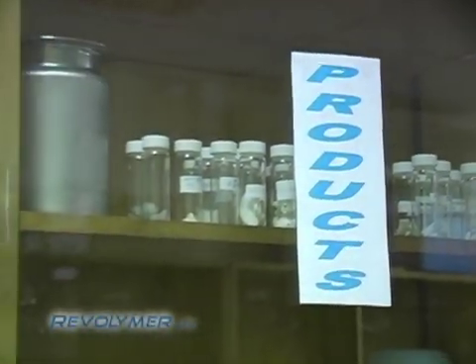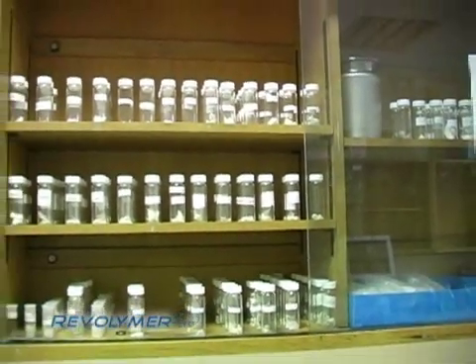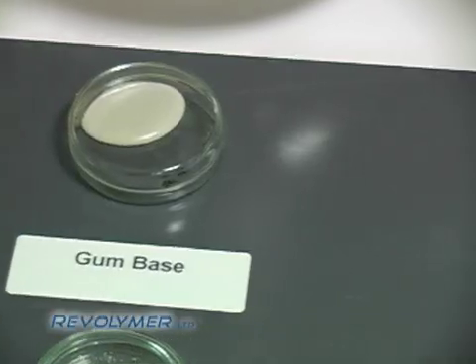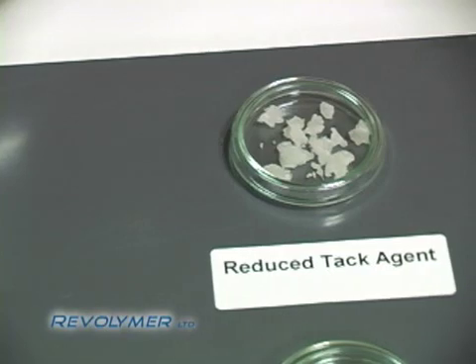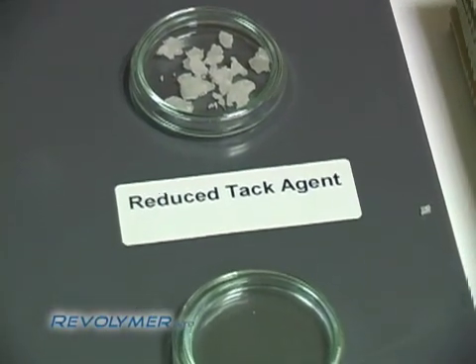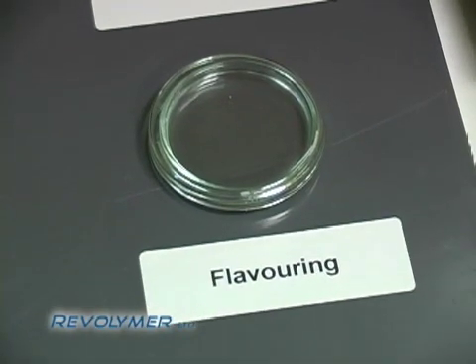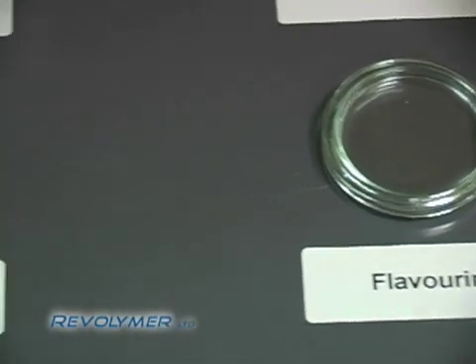In order to develop a low adhesion chewing gum, it is essential to make a very large number of different samples so that we can refine both the structure, the texture, the feel and the adhesiveness of our gum samples. So to do this on a lab scale is a bit of a challenge. We don't want to make kilograms of polymer that turns out to be useless in the chewing gum formulation.